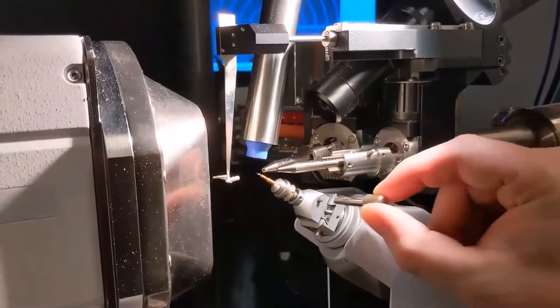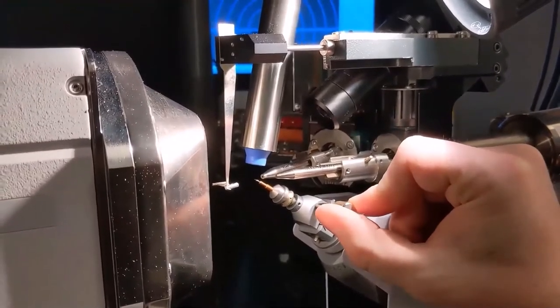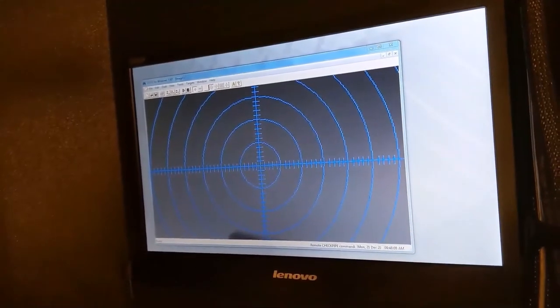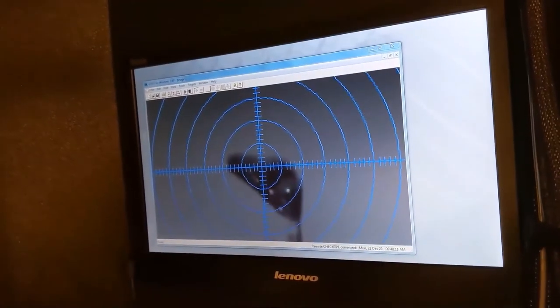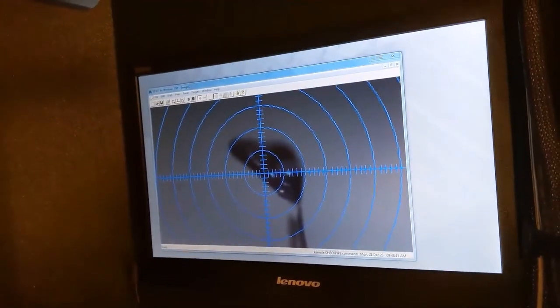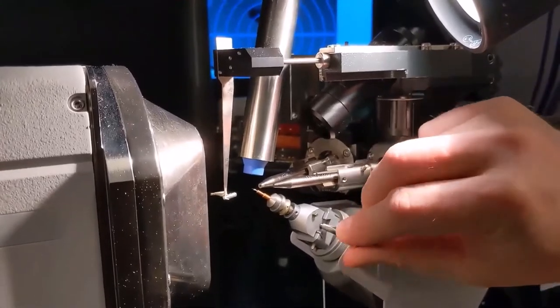To center the crystal, we use the tool seen here that fits nicely over the adjustment screws on the goniometer head. There are a total of 5 adjustment screws, 4 XY adjusters and 1 Z adjuster. The top screw on the only side that has 2 screws is the Z adjuster. Turning this one raises or lowers the crystal. The other 4 screws adjust XY position.